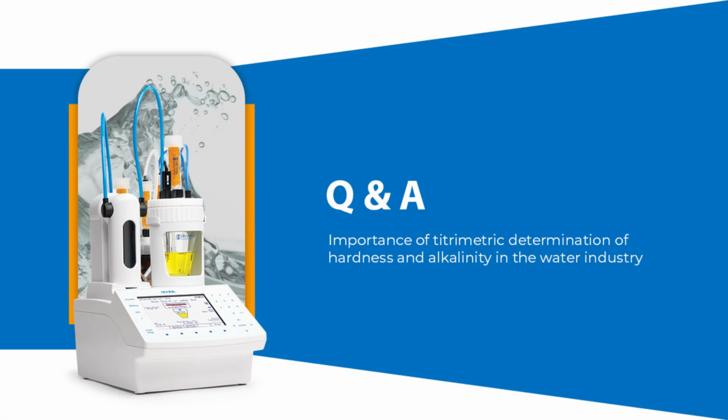So the first question is by Mohammed sir. What are the limitations of the titrimetric method?